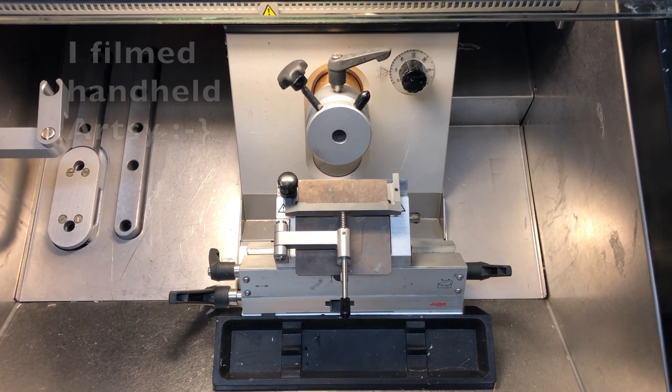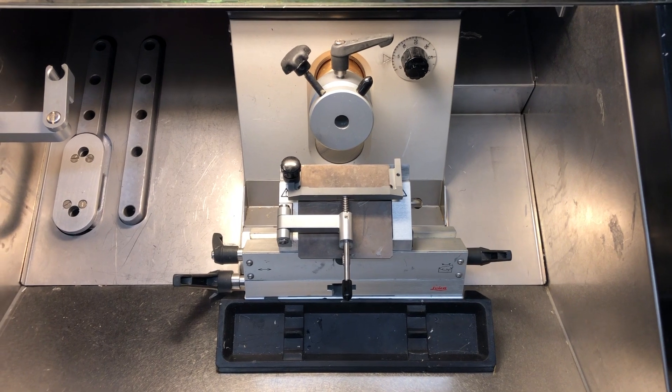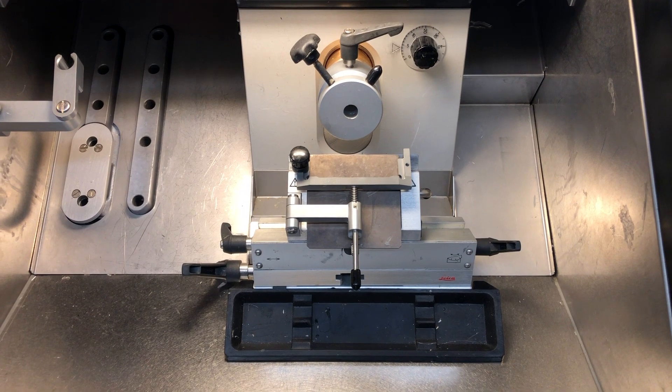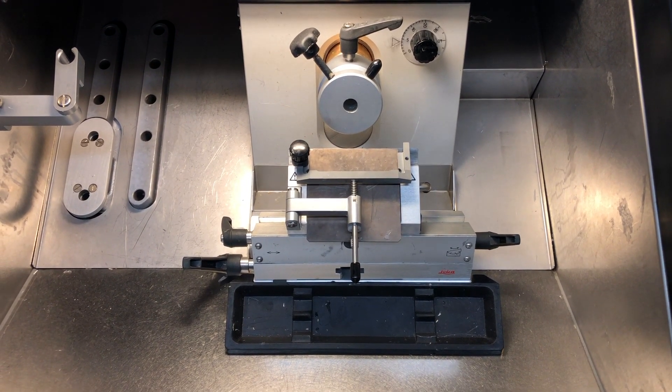Here's a problem I came across recently. A lab called me up and said, 'Hey Matt, our cryostat won't advance anymore when we cut. We can use the buttons to advance and retract the object head, but when we go to cut, the actual tissue is not moving forward towards the blade.'